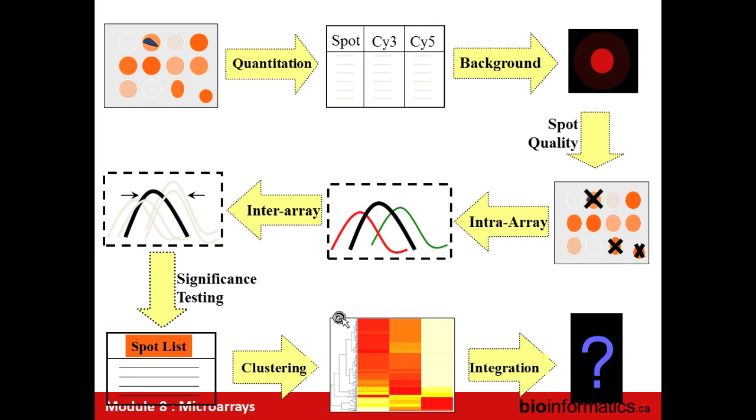And so you think about whether or not, for example, it's a good idea to actually look at the images for all your arrays. Not spend hours doing it, but if you have 50 of them, then 30 seconds on each one is a valuable exercise. Most of these are pretty minimally parameterized algorithms. It's actually quite clean that way, especially relative to sequencing data. Typically, your choice is algorithm A versus algorithm B, rather than reparameterizing algorithm A.